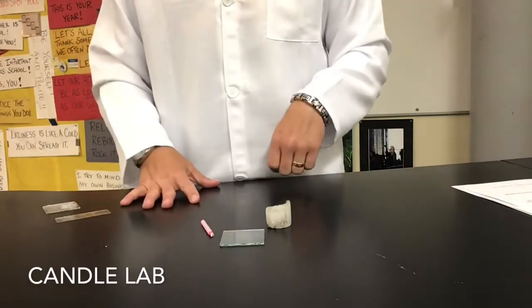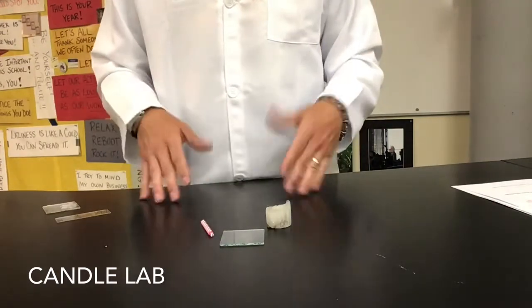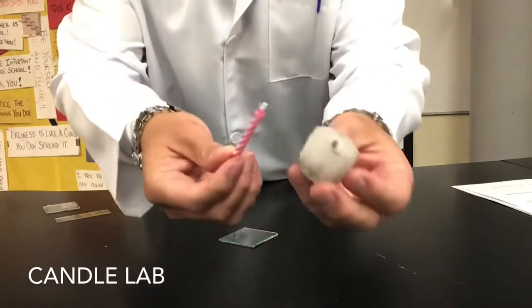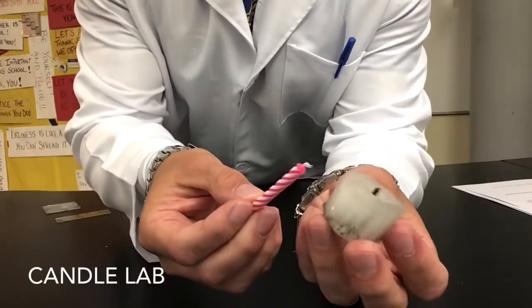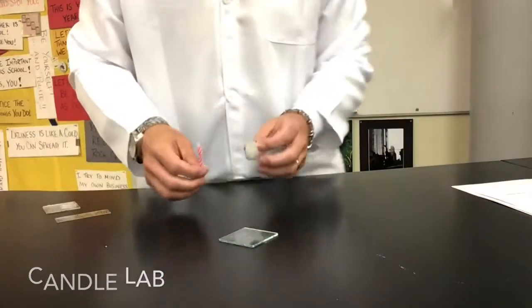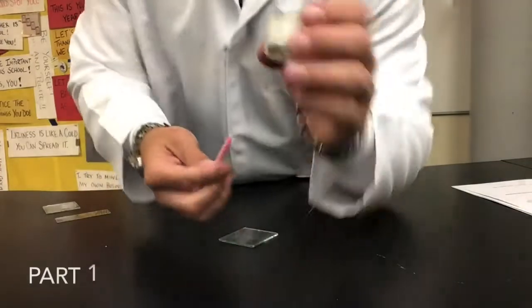So the candle lab is going to help us get warmed up into that. And we'll do a little bit of a controlled experiment to start to figure out what exactly is it that allows a candle to work. Is it the wick? Is it the wax? Let's talk about it.